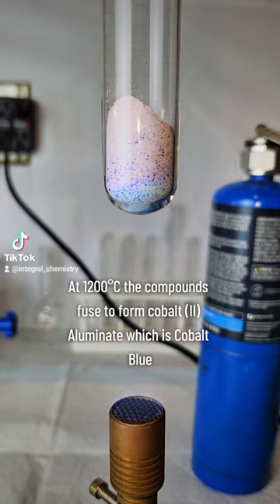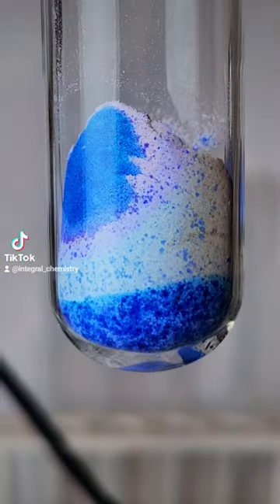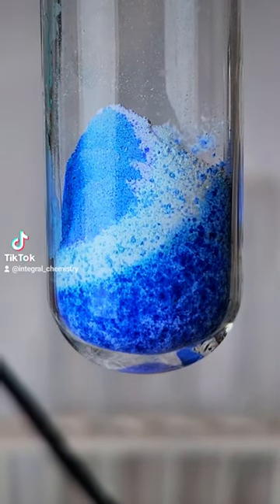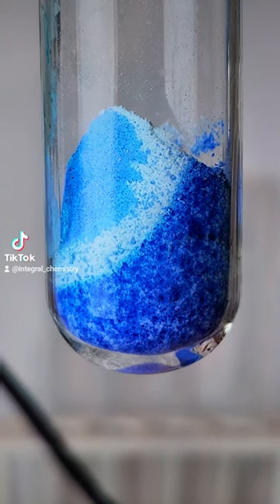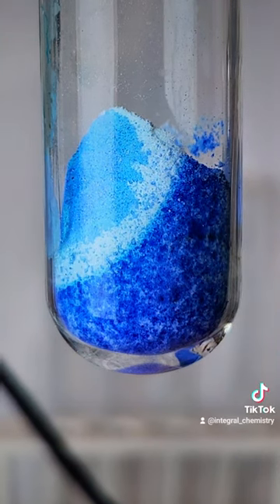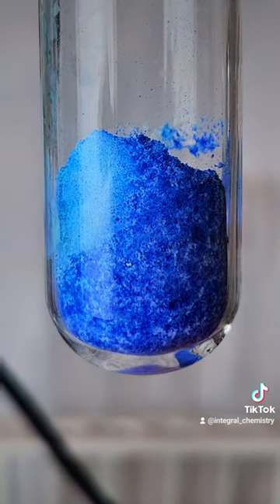Very quickly it starts to turn blue, and at first this is just the color of cobalt chloride when exposed to high heat. Eventually though, at around 1200 degrees Celsius, the aluminum hydroxide will decompose to aluminum oxide and water. The aluminum oxide will then go on to bind with the cobalt to form cobalt aluminate, which is cobalt blue.